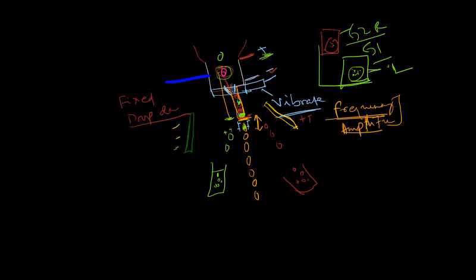And what if there is a cell that doesn't have either of the fluorochromes, it doesn't fall in either of these regions? For example, it is coming in this region, so it doesn't fall in. If we are not giving a sort command, we don't wish to sort this cell, then in such a case, what will happen?